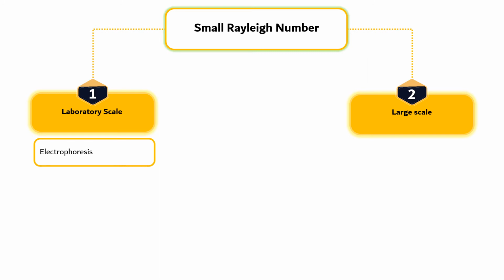A variety of gels can be used, but polyacrylamide is often used. After the electrophoresis, different solutes can be separated by cutting the gel into parts. The solutes can be eluted from the gel and purified further if necessary.